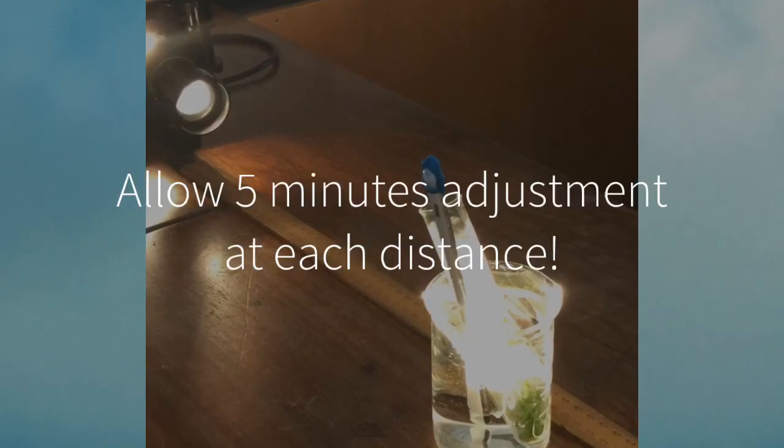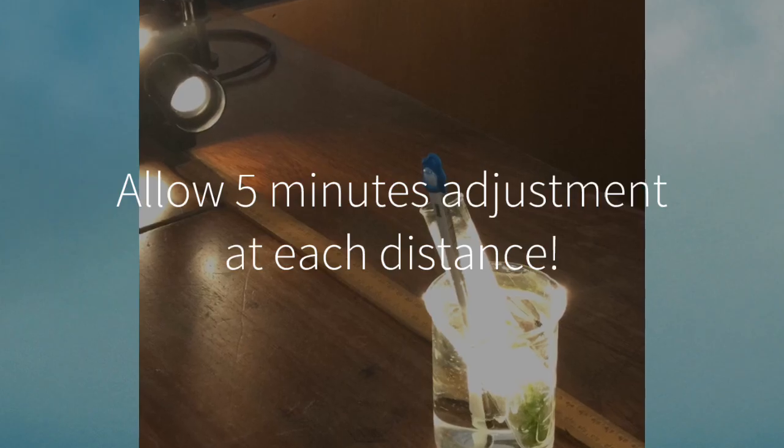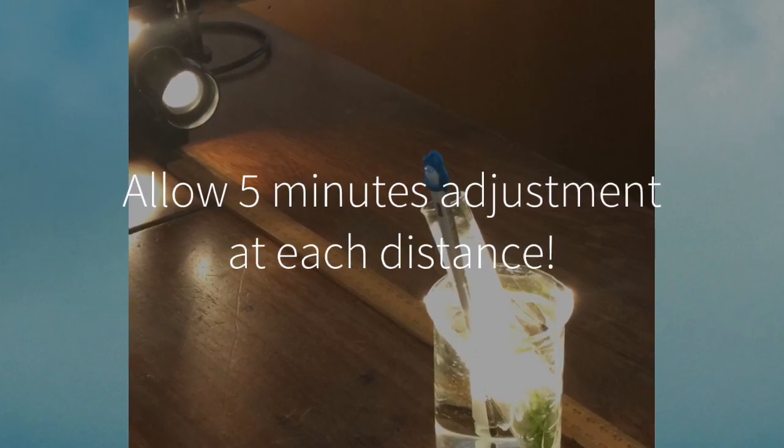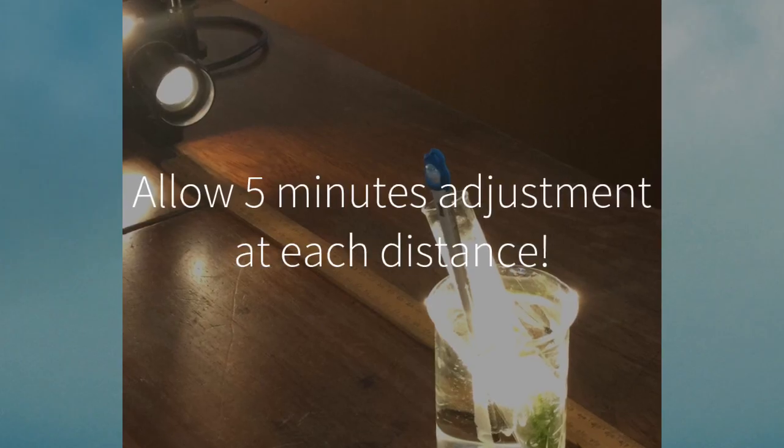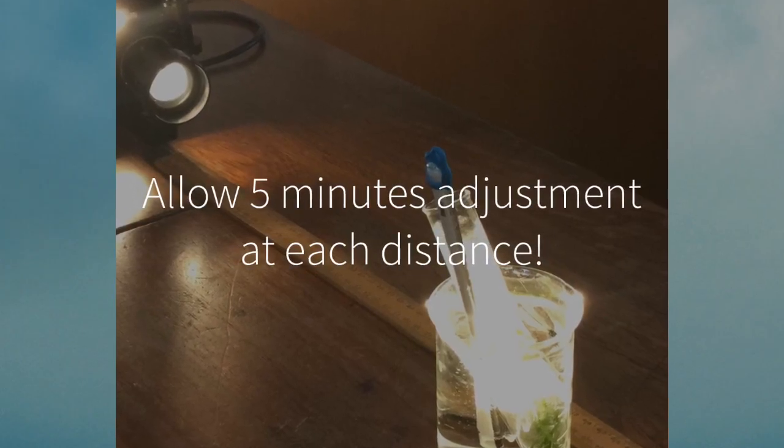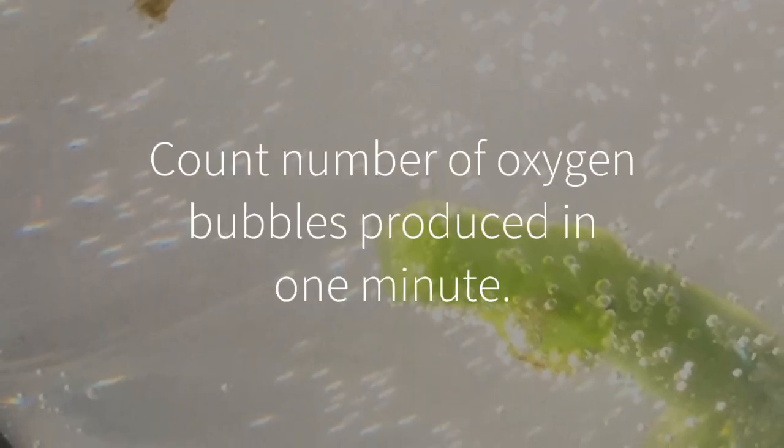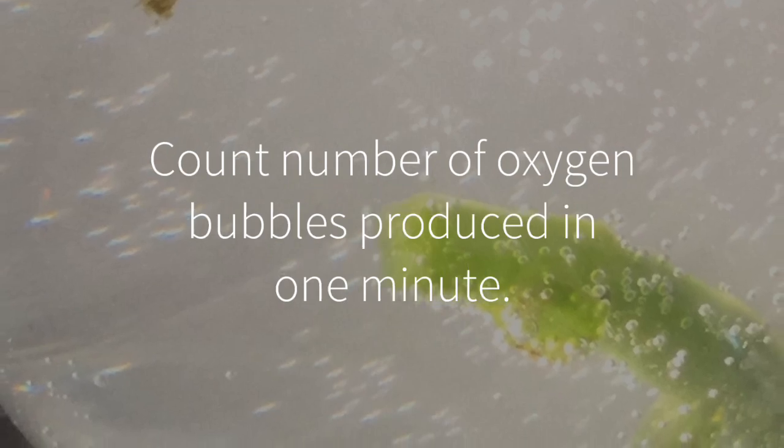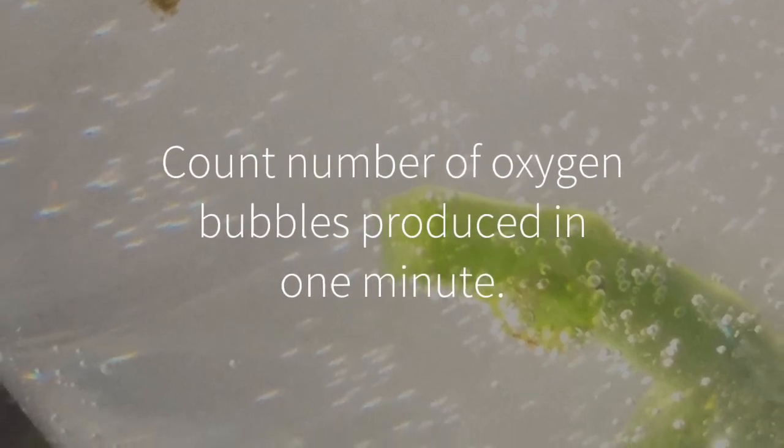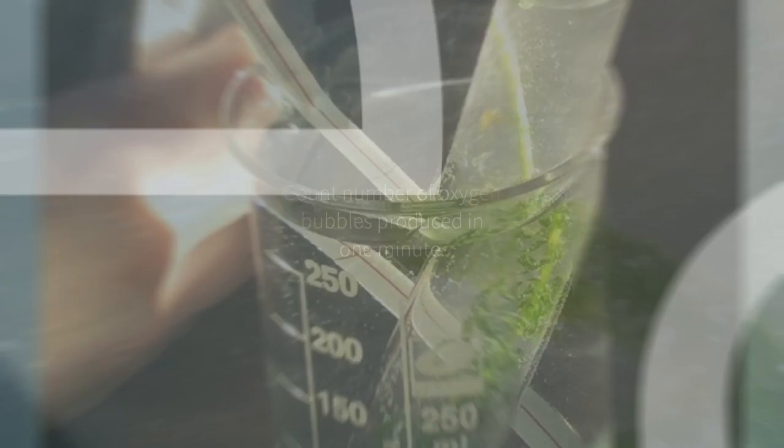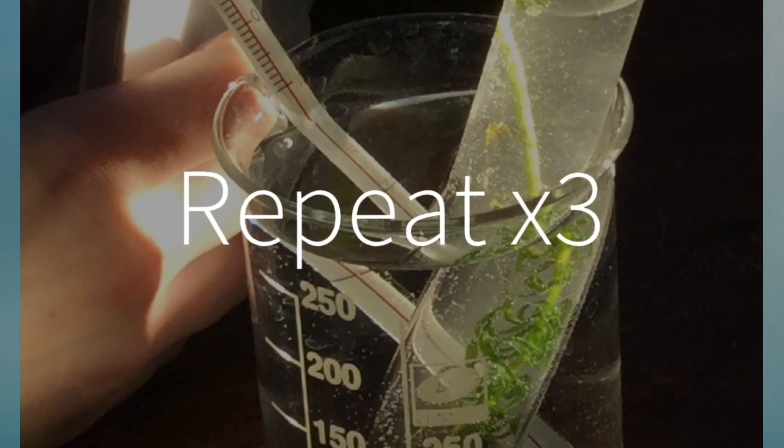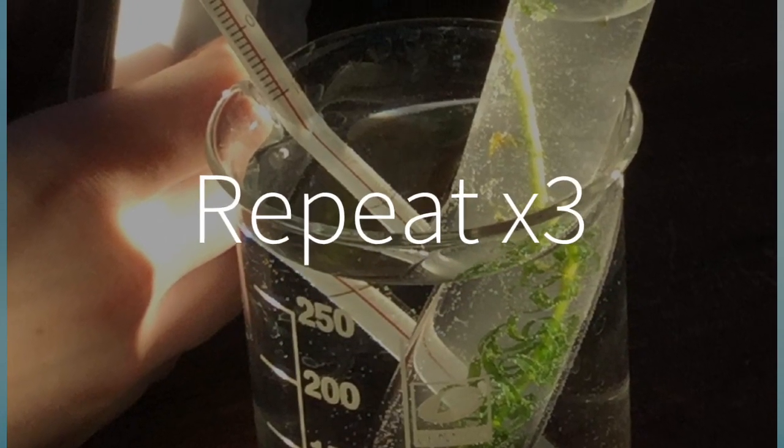It is most important that you state that you allowed the allodea to adjust for five minutes to the new light intensity each time you moved it before you started counting the bubbles. After the five minute adjustment period, we started to count the number of oxygen bubbles that were released in one minute. This was repeated three times for each of the light intensities and the average was calculated.